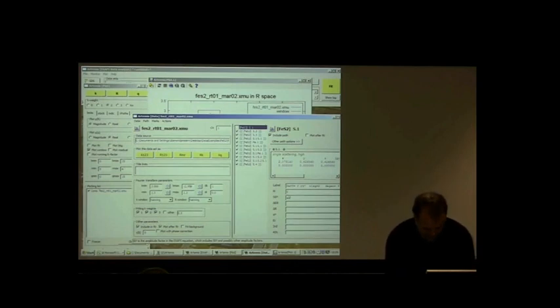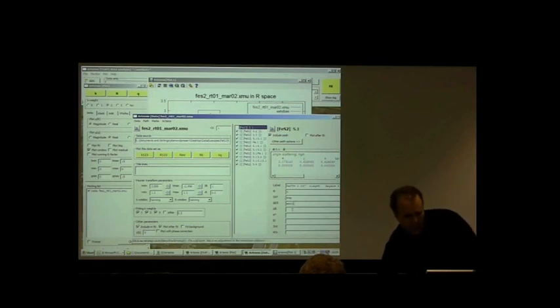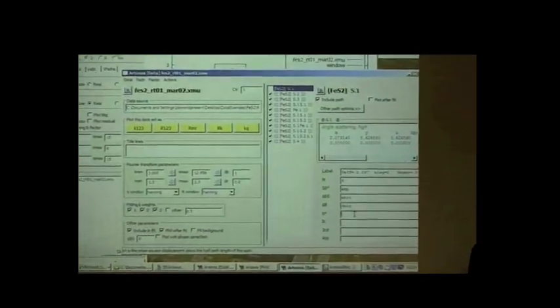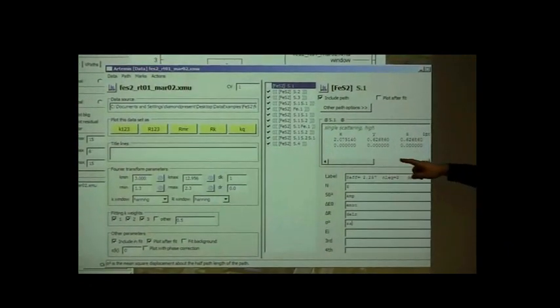I'm going to define a word to represent the E0 shift, and I call it E naught. I'm going to define a third word that is the delta R in the second line. And I'm going to define a word that represents the sigma squared at the end of the first line. Now, it's not sufficient to just write them down here, and this is the crazy part.